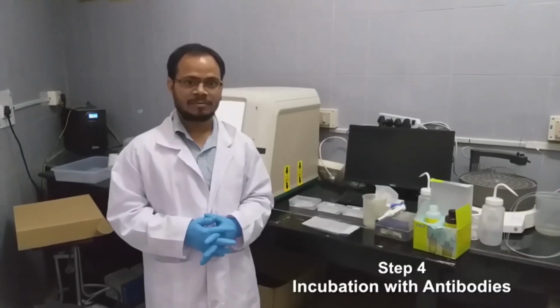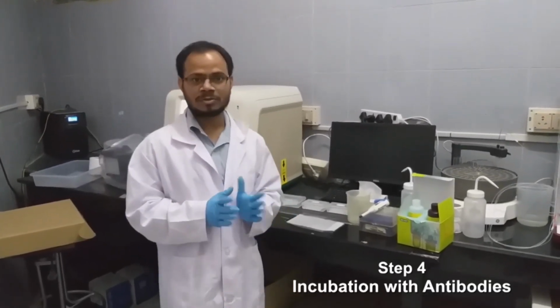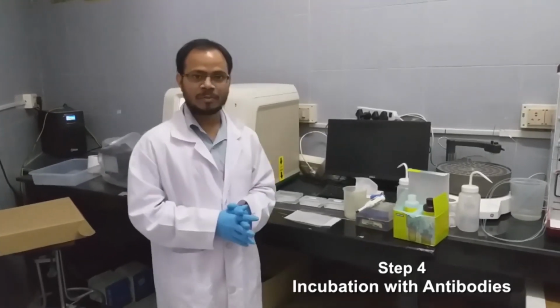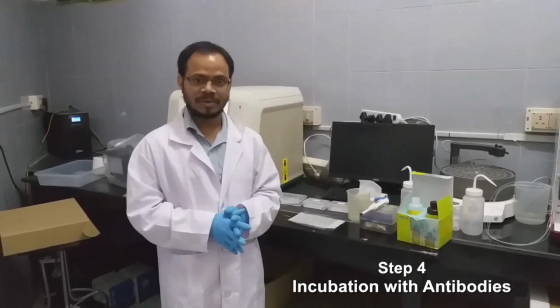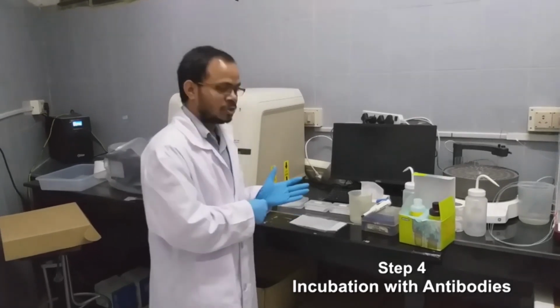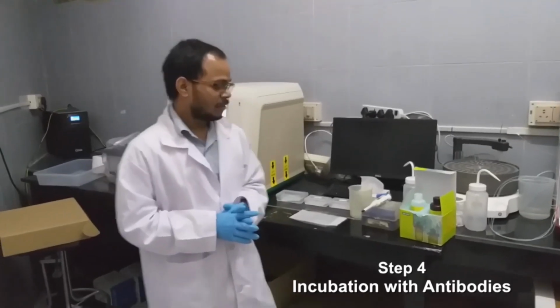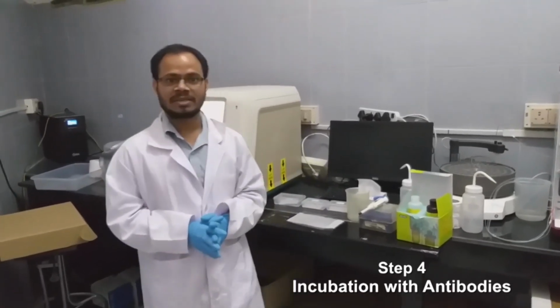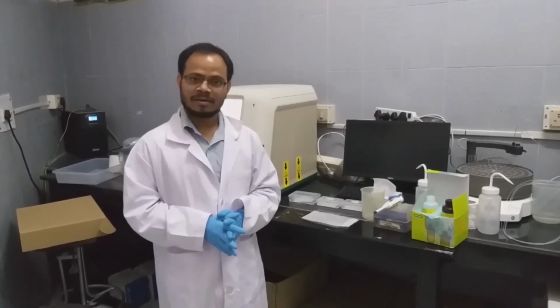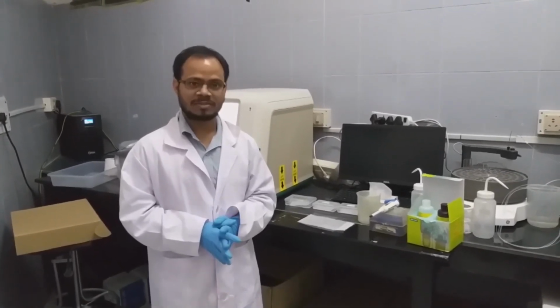In the earlier video on how to do Western blot, we showed how to transfer the proteins to the membrane. We incubated with the primary antibody followed by the secondary antibody and washed thoroughly. Now here we show how to develop a blot. For developing a blot, we need a chemiluminescent substrate. In most of the commercially available kits, luminol is one of the substrates used for this purpose.